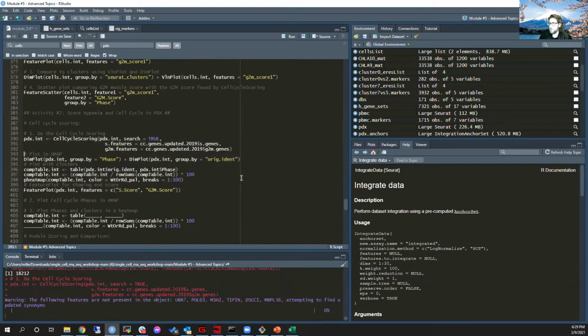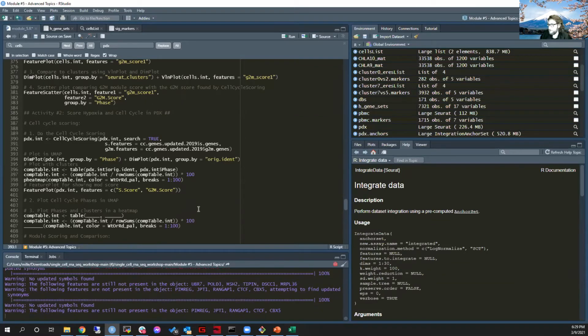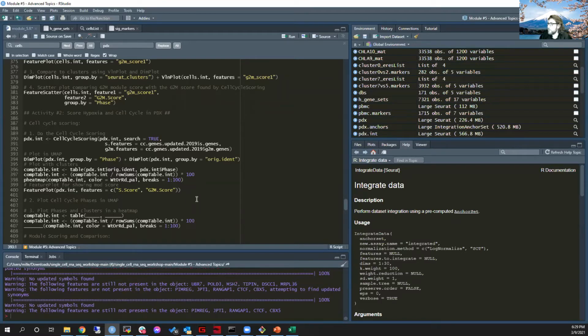All right, go ahead and run that. And I'm going to put this in the chat.